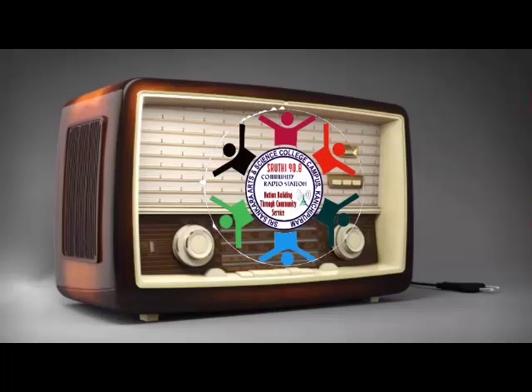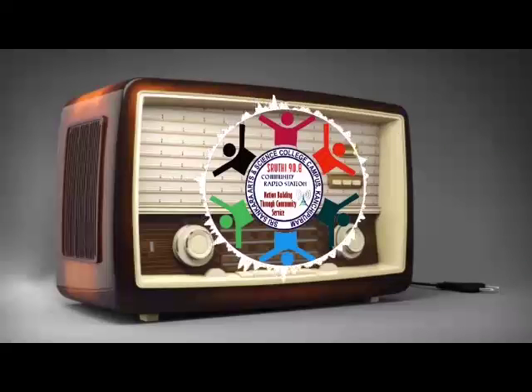Next, fluidized bed bioreactor. In this type, the fermenter is filled with solid particles which are suspended in an upflowing liquid stream, which is supplied at the bottom of the bioreactor. The solid particles present in the bioreactor are easily distributed throughout the bioreactor, so that the smaller particles are found at the top of the fermenter and the larger particles are found at the bottom. This type of reactor is commonly used for the production of alcohol with flocculant yeast. The advantages are uniform particle mixing, uniform temperature gradient, and ability to operate this type of reactor in continuous state.